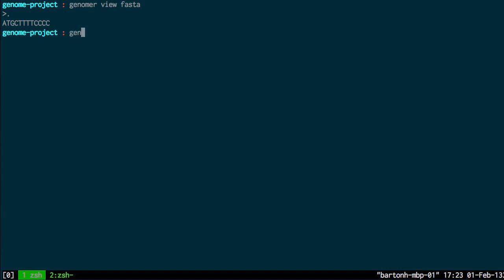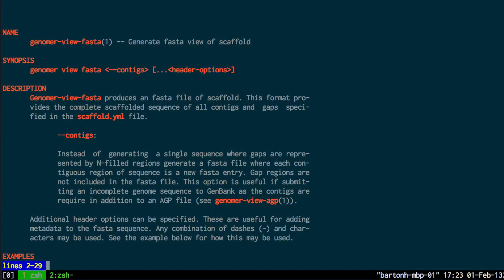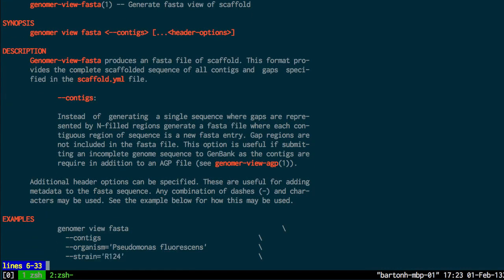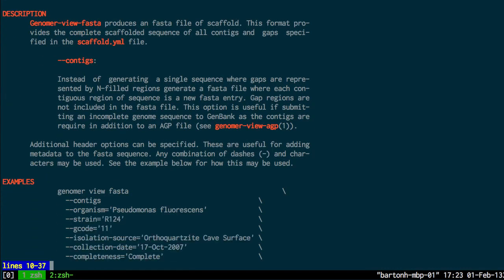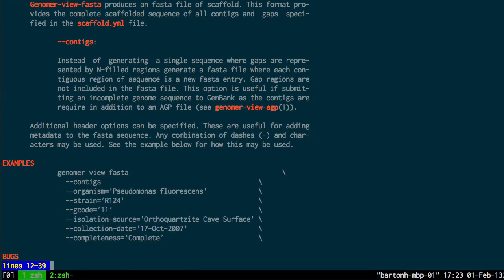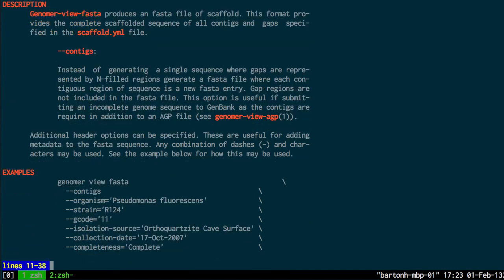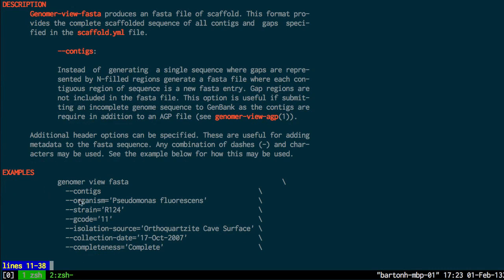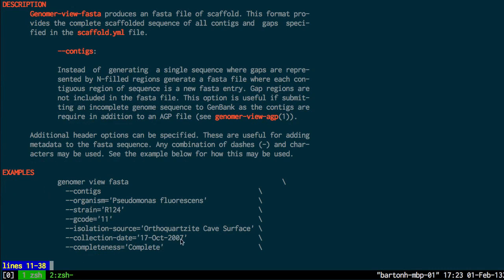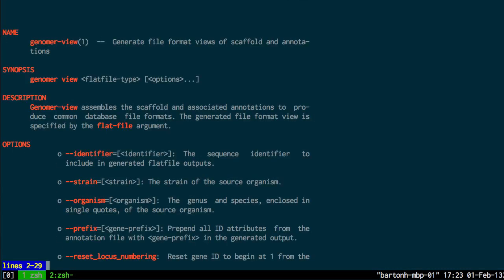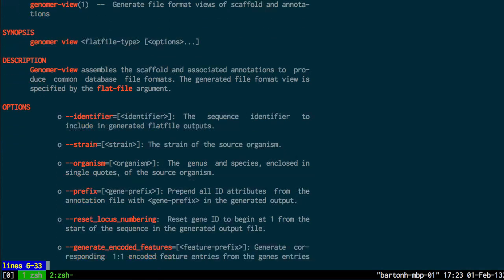And if I go back to the man page for view FASTA, that should be man view FASTA. You can see there's some options. I can for example specify contigs or strain or organism. And the Genoma view has more options here. So identifier. Here's the list of the options.